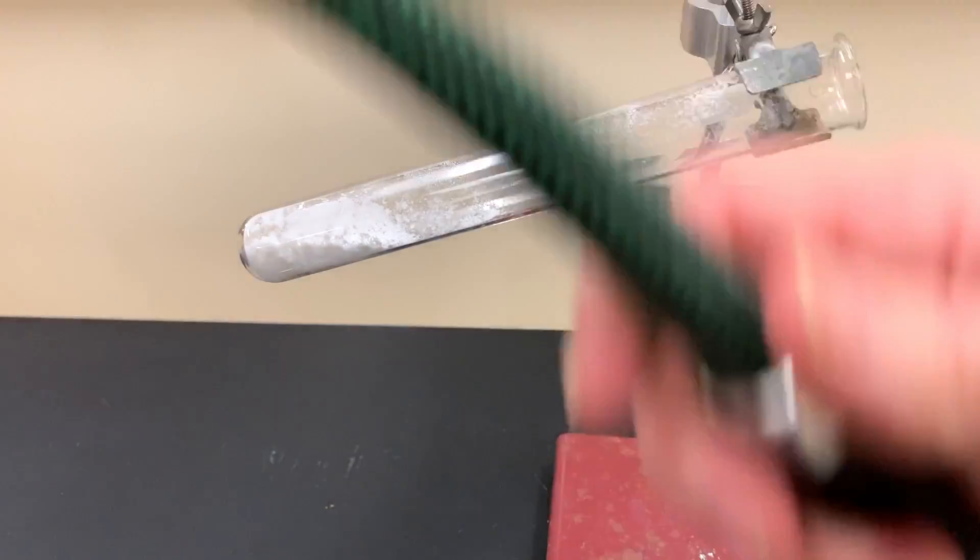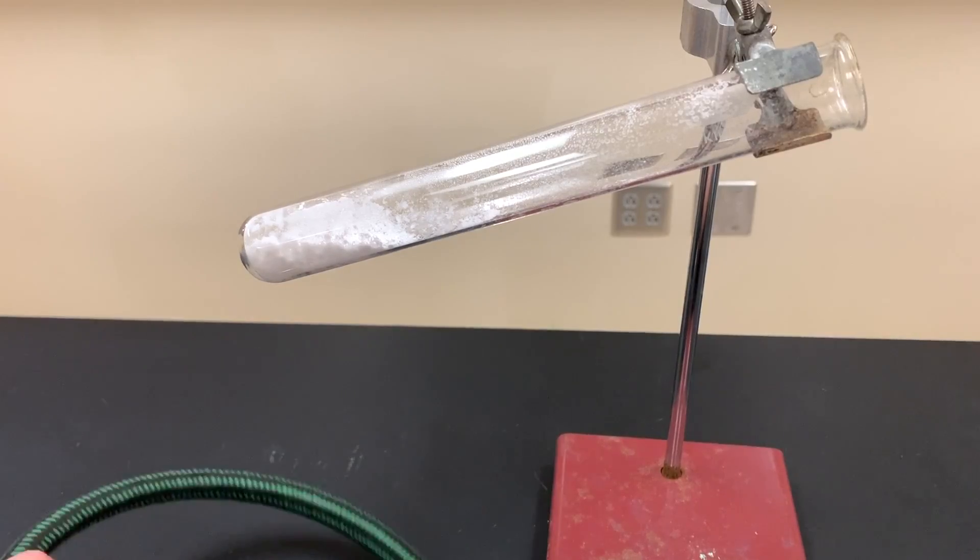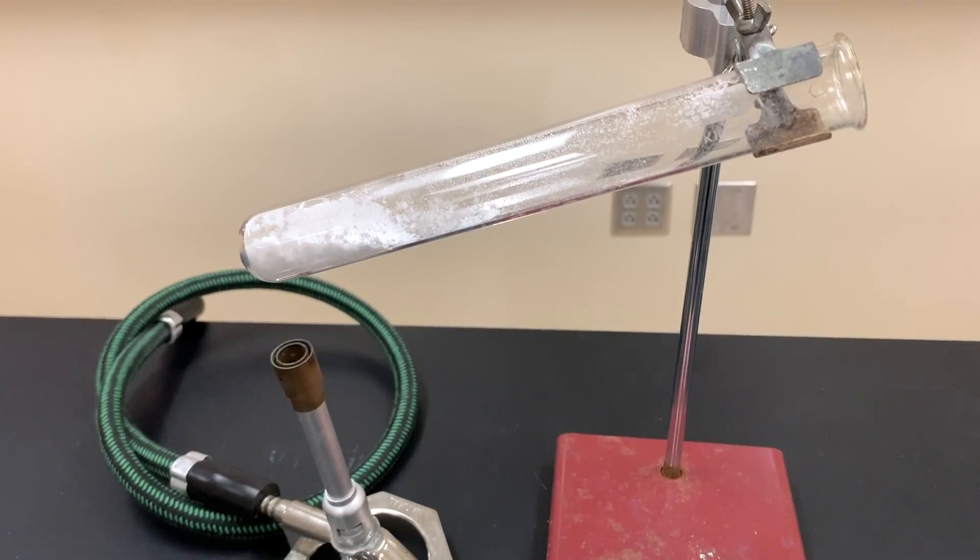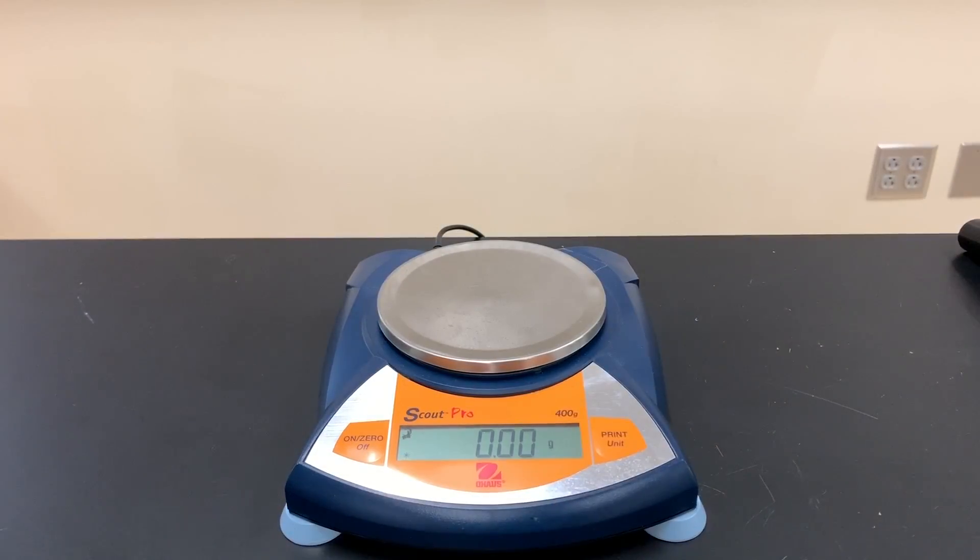And then again I have my students take the Bunsen burner and pretzel it so that I know that it is no longer having any methane coming out of it. So now it's just time to wait for this to cool and then re-weigh it.